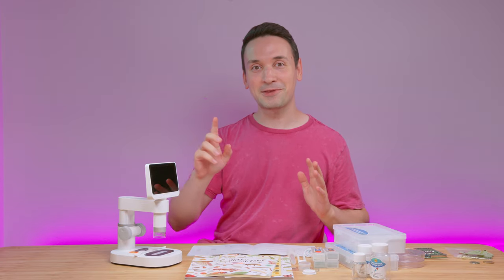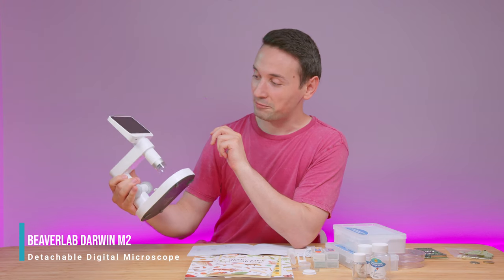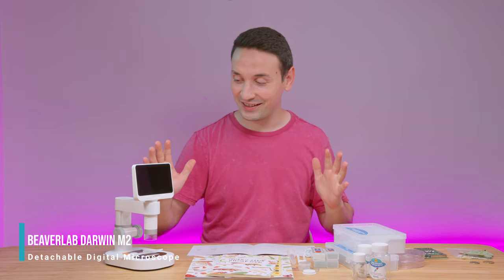Hope you're having an amazing day. Today I have something very special — I wish I had this when I was a kid. This is the Beaver Lab microscope M2. They sent me this and I'm glad they did; I've had quite some fun reviewing it.